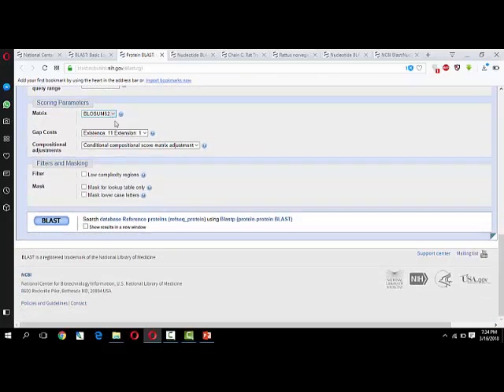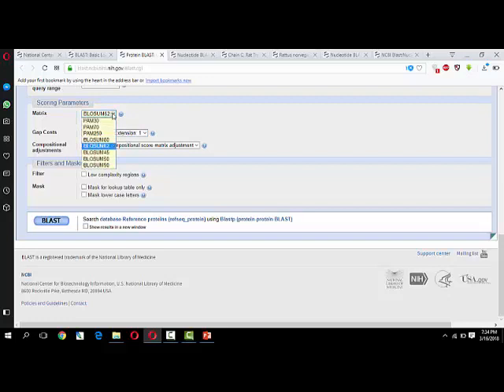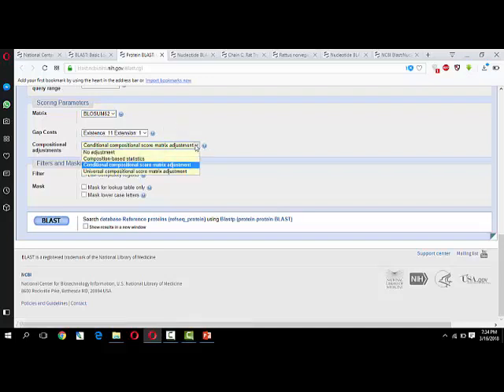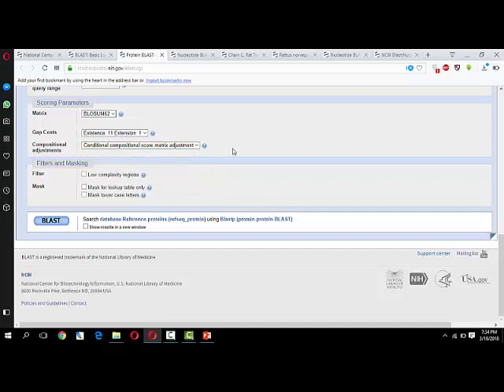Go to algorithm. You have BLOSUM62 here. We are going to use BLOSUM62, though you can change it to others. If you want to select anything from here like no adjustment, composition-based statistics, conditional compositional score metric matrix adjustment, universal compositional score matrix adjustment, you can select any one. I'm going to work with conditional compositional score matrix adjustment. Now if you click here, you will get results in another screen. Click on BLAST.